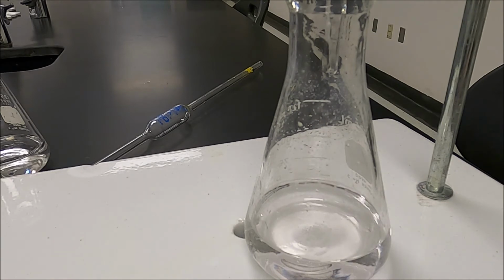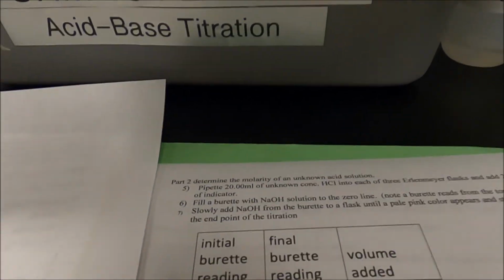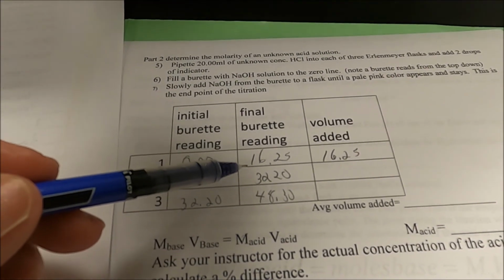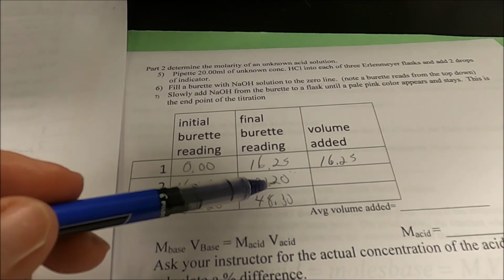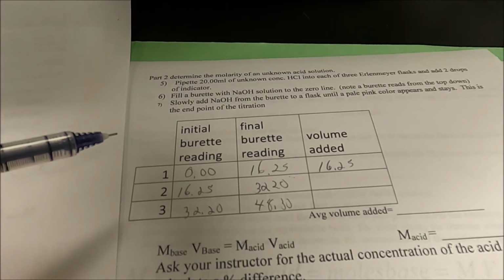So now we want to look at doing our unknown. Now, instead of making you watch me do 3 more titrations, I've already done the unknown. And here's our data, okay? The initial burette reading on run 1 was 0. The final burette reading was 16.25. For the second one, we started at 16.25 and went to 32.20. And for the third one, we started at 32.20 and went to 48.30.